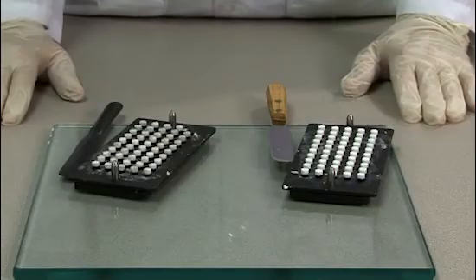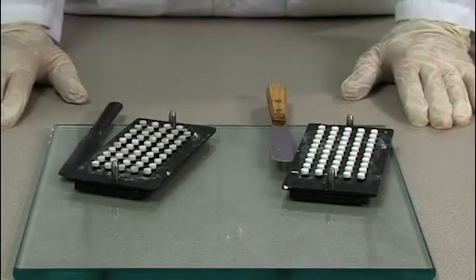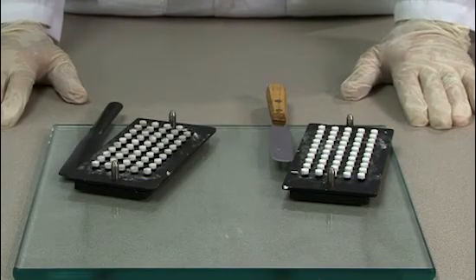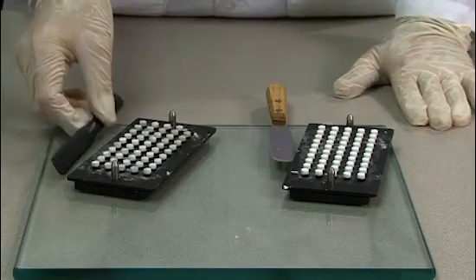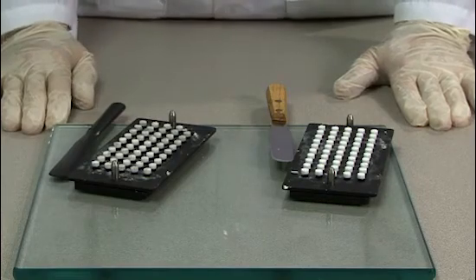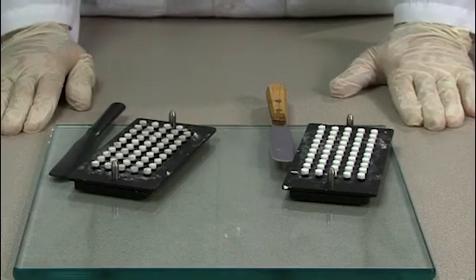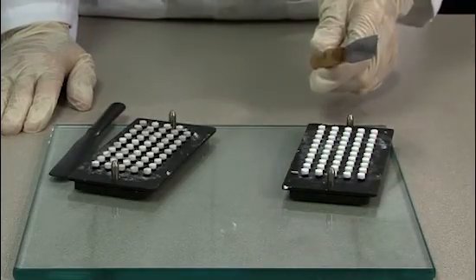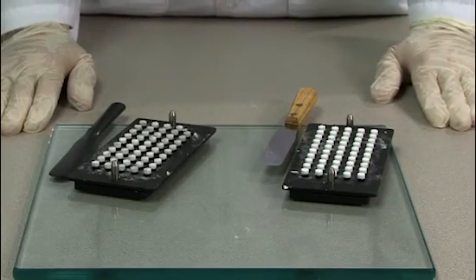I don't have the plates here to show you, but the same effect happens if you use the aluminum plates, the silver-colored plates. You see the same effect, that the hard rubber spatula is the one that is producing these gray tablets. So, when making metoprolol tablet triturates, it is important to use a stainless steel spatula to press the tablets into the cavity plate.